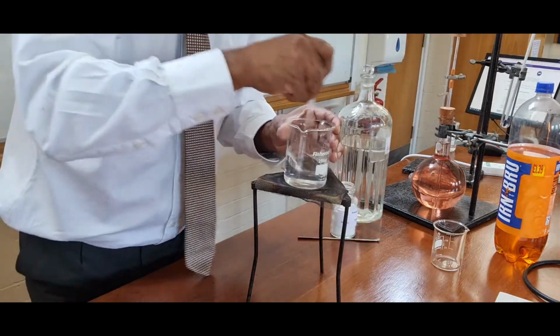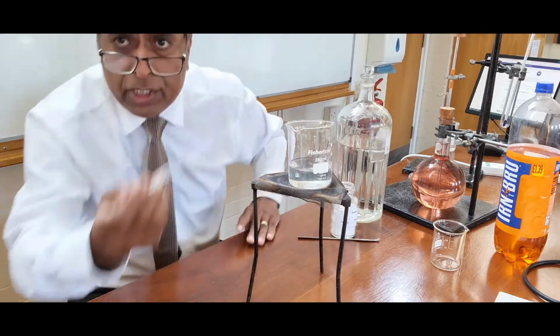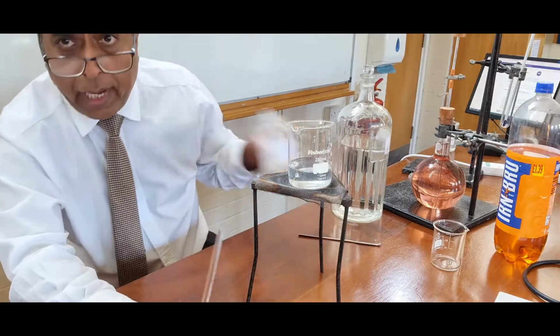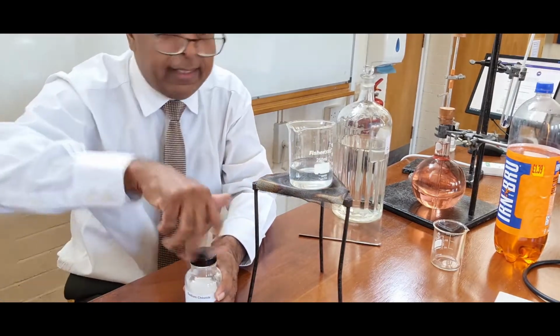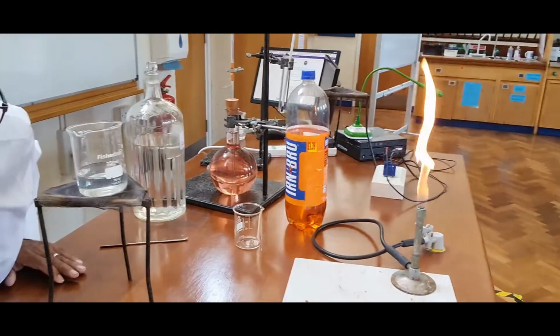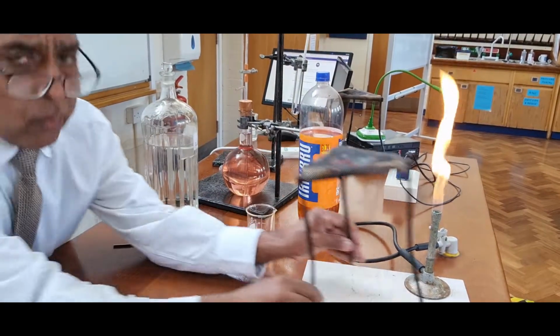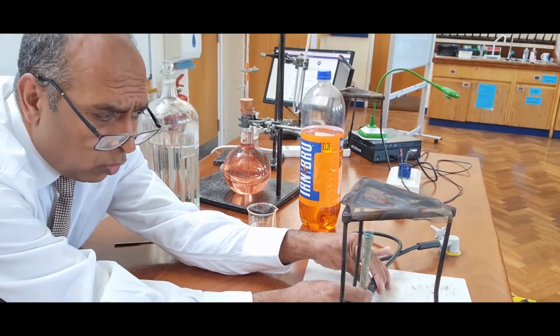If I exceed the solubility, then the solution will be saturated, and if the solution is saturated, I won't be able to get any more salt to dissolve in there. And I have a Bunsen burner. So if I really want to dissolve something quickly, I would warm up the water.